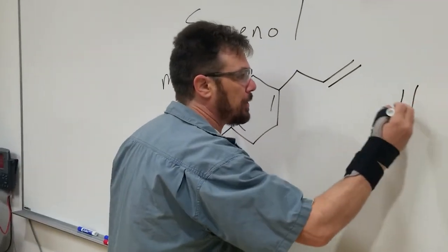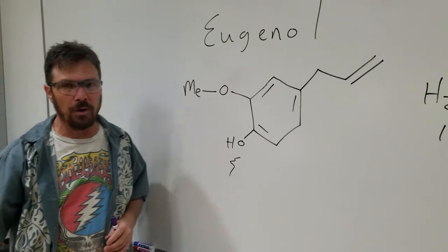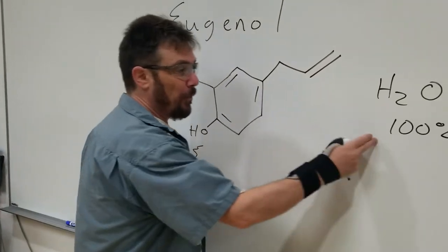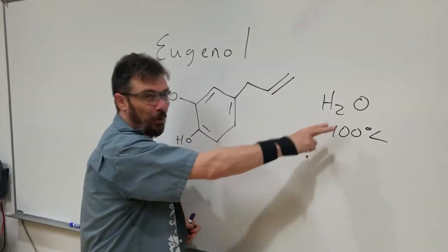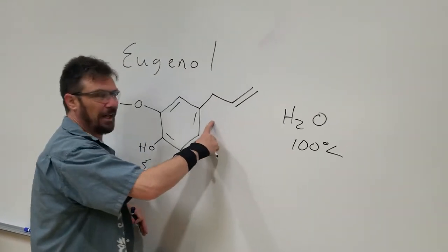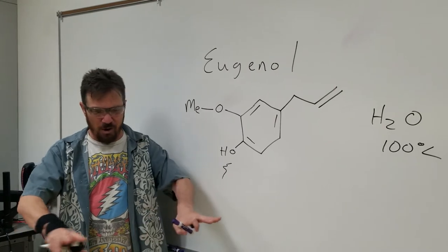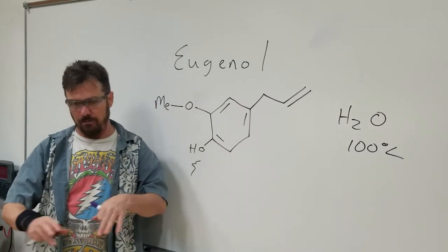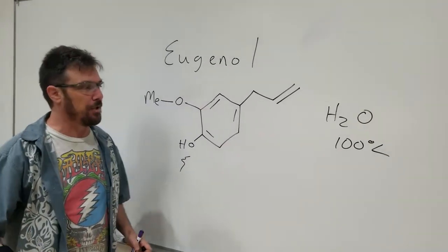Compared to water, which boils at 100 degrees Celsius, eugenol boils at about 255 degrees. If we wanted to separate these, we could do a fractional distillation. But that's not what we're trying to do — we want to co-distill these. When the water comes over at 100 degrees, it'll have some eugenol mixed in. If you've ever noticed oil building up around your stove when you're frying something, that's steam distillation — water is boiling out of what you're frying and carrying the oil with it. That's steam distillation happening in your own home.